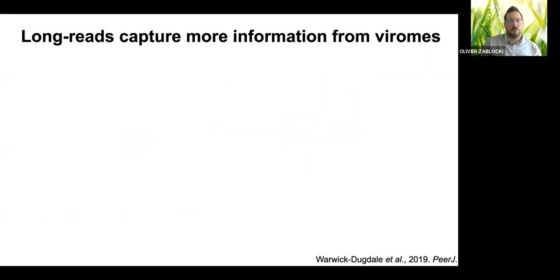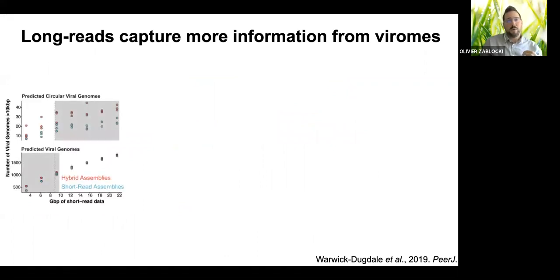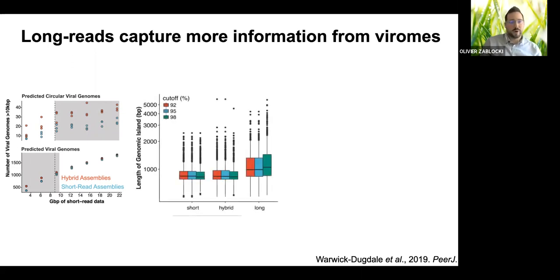And so obviously here we will go into more details for long reads, and the study I showed you before was authored by colleagues at the University of Exeter, with whom we co-developed a way to sequence viromes with long reads called virion. And so what they found is that using long reads, they compared the results to a short read data set.